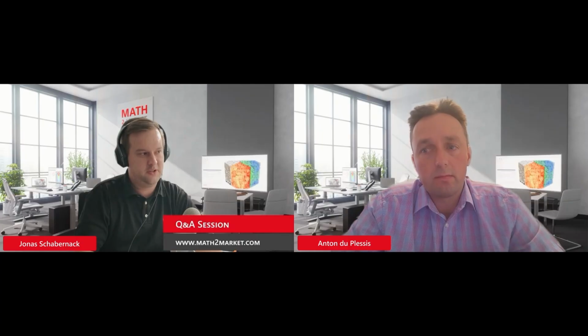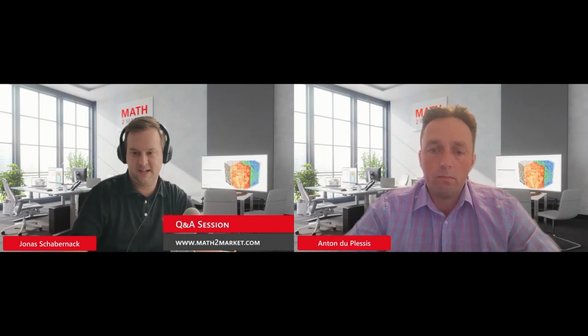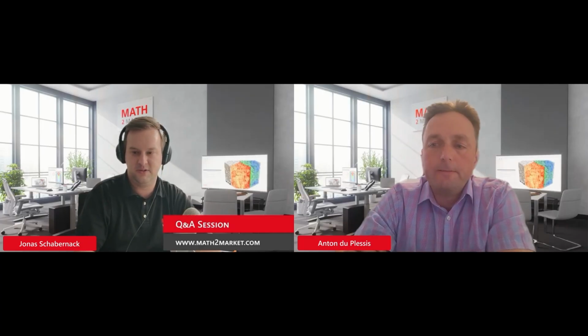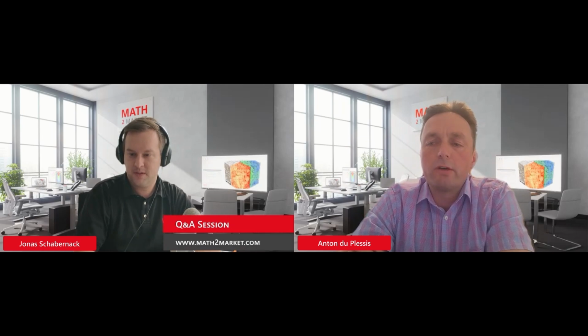Based on that, you can certainly get some quantitative values out of it. I don't think it's automatically calculated, but as the results are there, you can of course compute it based on that. So you for sure get a visual representation, and based on that, you can also compute the error yourself. It's technically possible, but it's not a standard output at the moment.